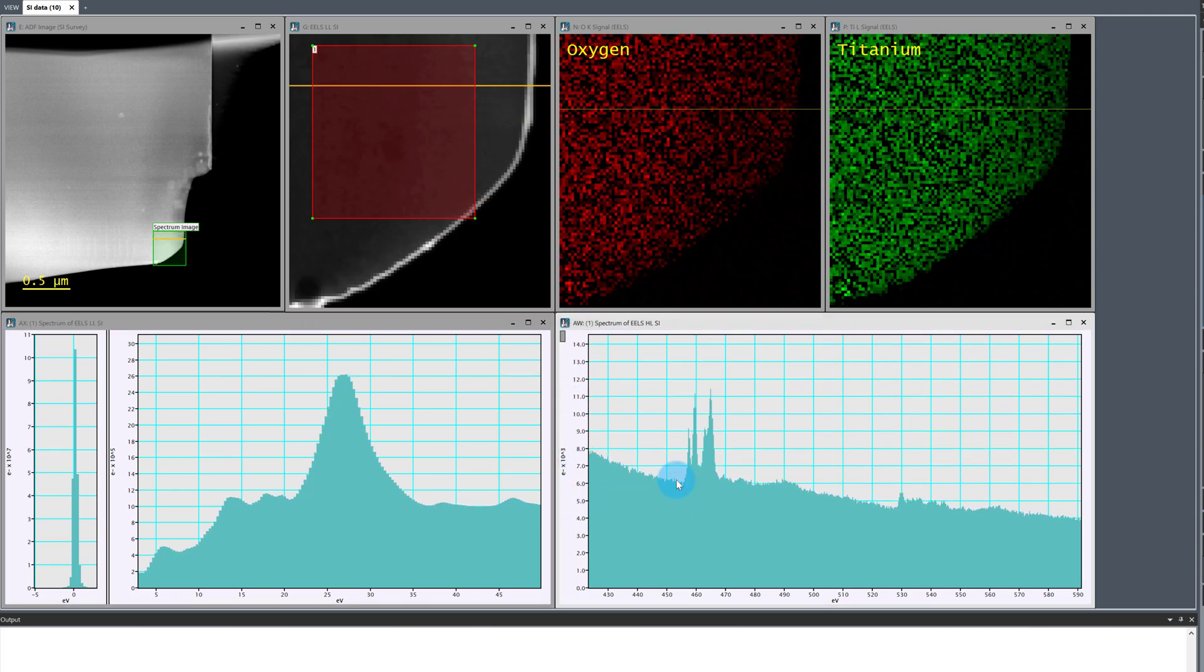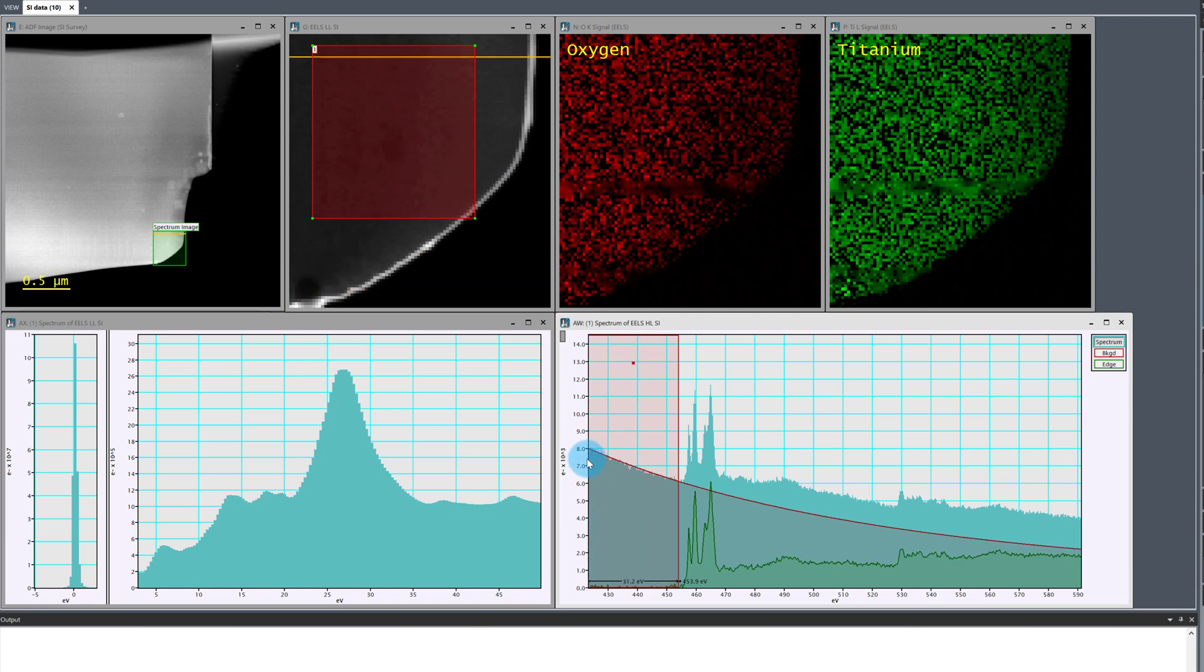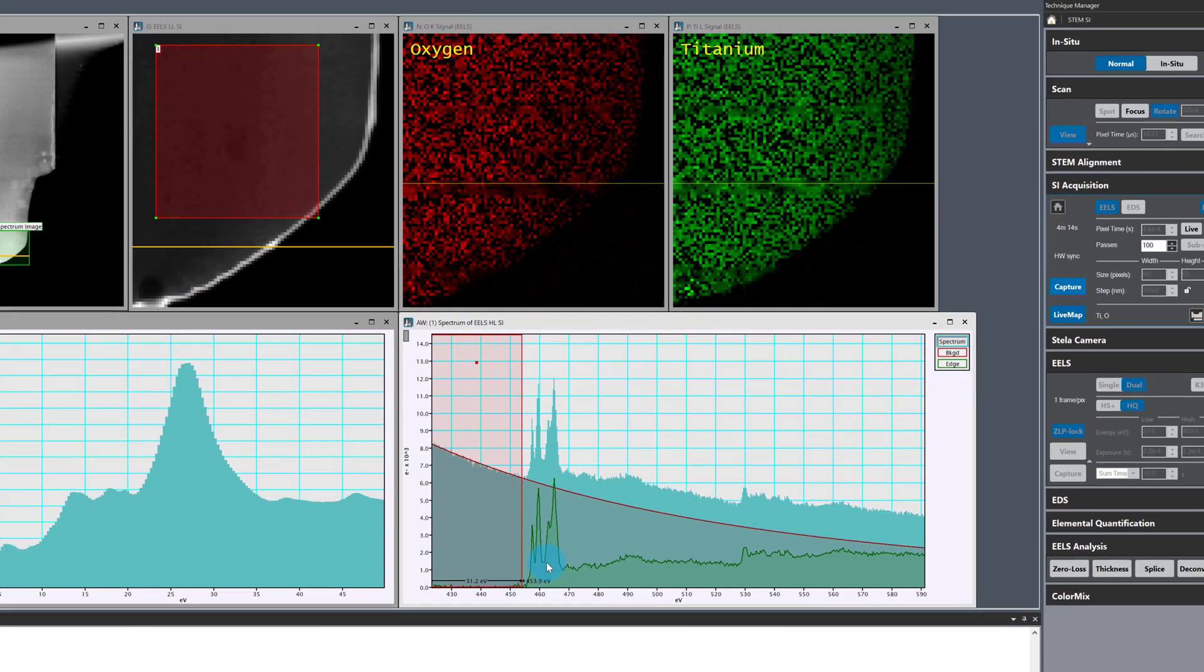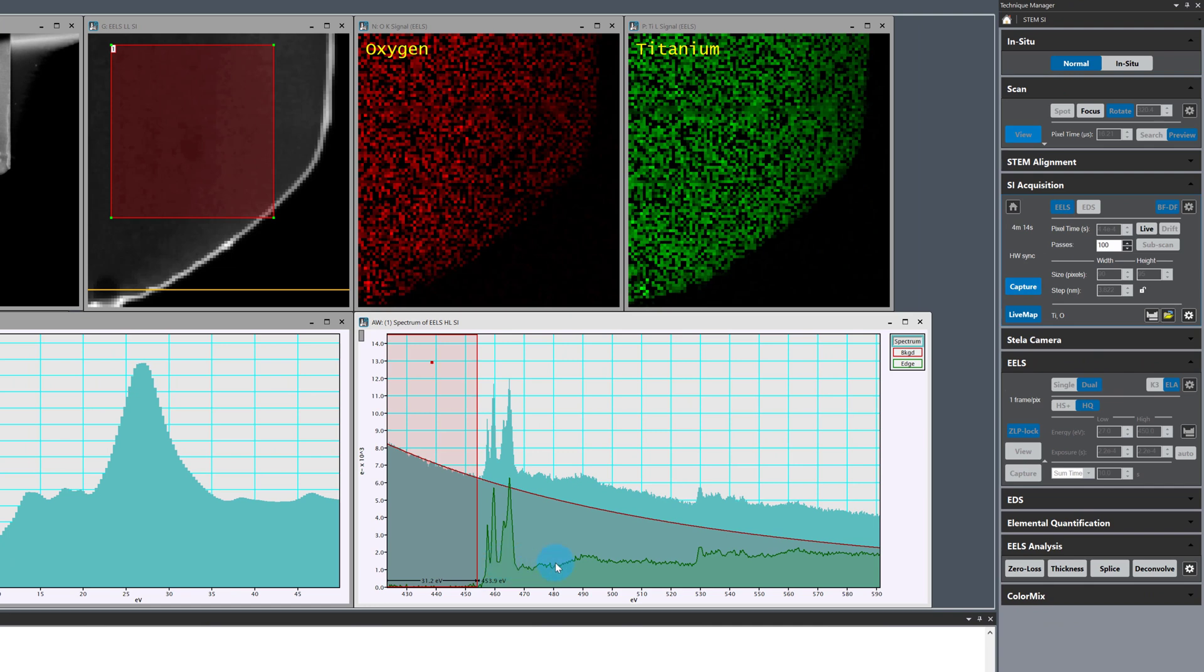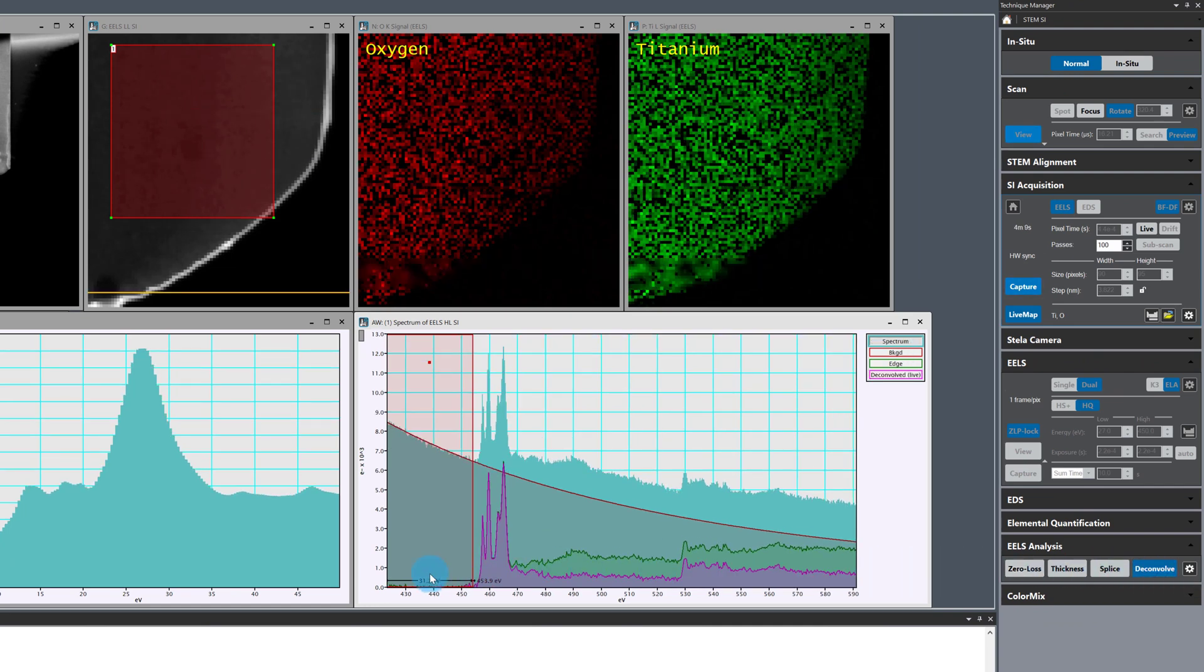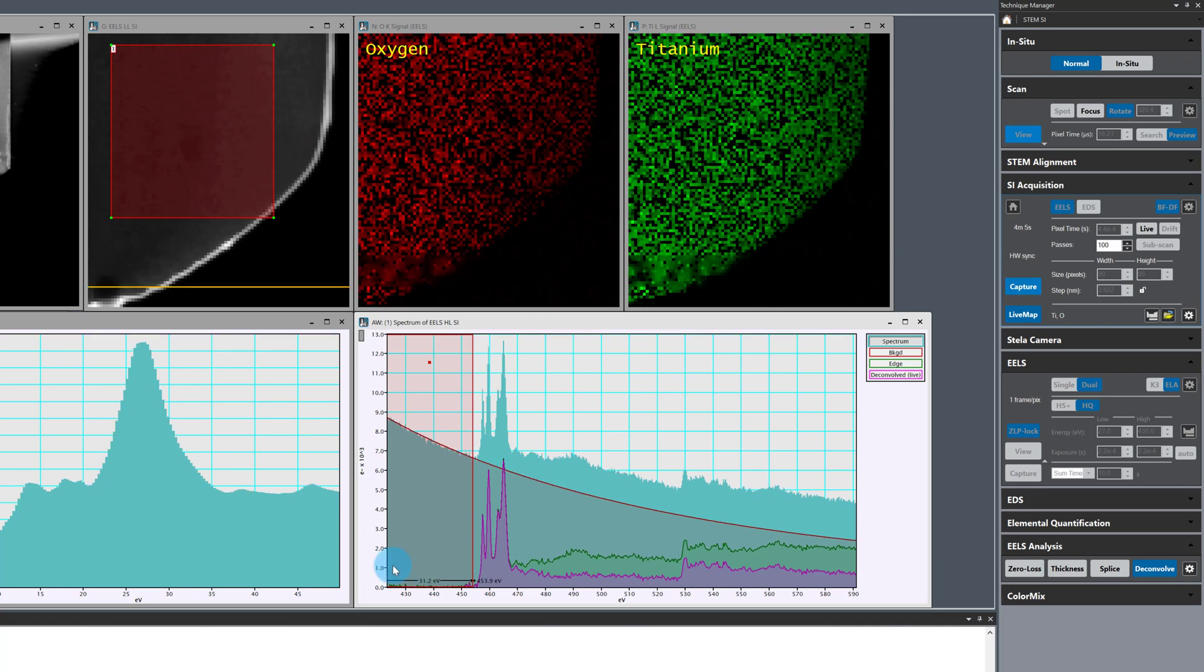Now I'll just add a pre-edge background window and hit deconvolve in the EELS analysis palette to perform a live Fourier ratio deconvolution on the core loss spectrum as I let the multiple pass acquisition continue.